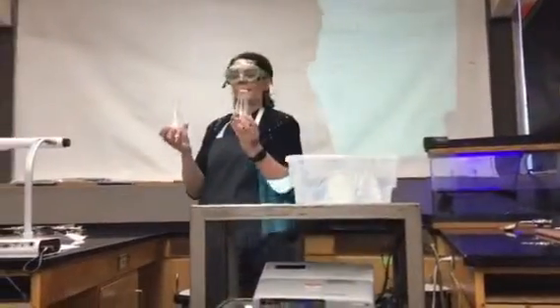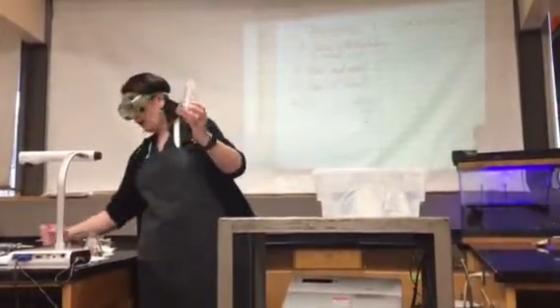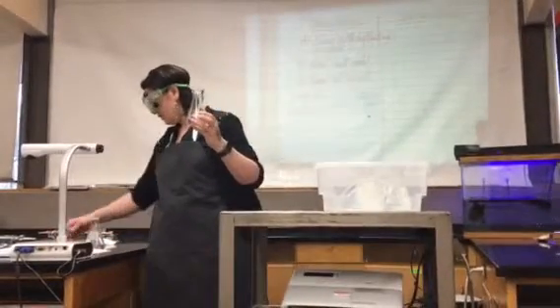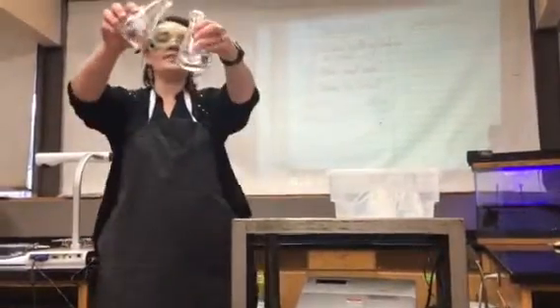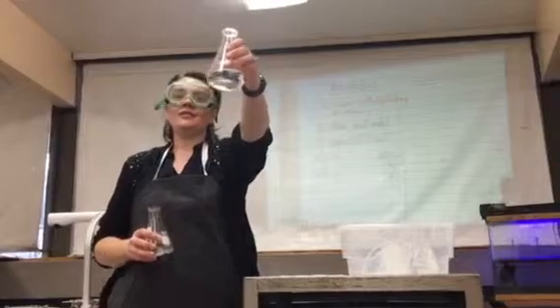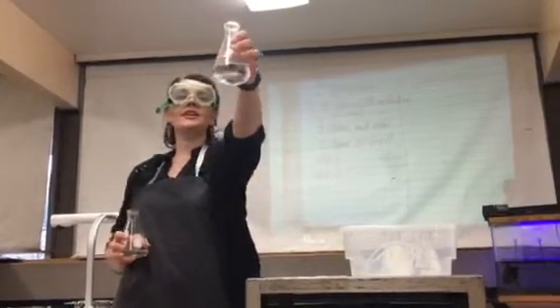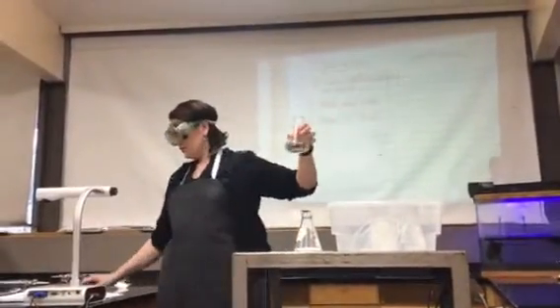Okay. So, did you write down your observations for A and B? Super. Now I'm going to add C. So, in this vial, I'm going to have A plus B plus C. And we're going to see what happens. You ready? Everybody's eyes on it? 1, 2, 3. Nothing's gonna happen. Okay, I'm messing with you again. Nothing happened again. It does still look jelly-like. It is still clear. Will it kill a turtle? It would definitely kill a turtle.